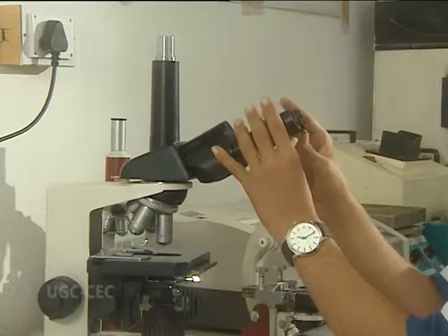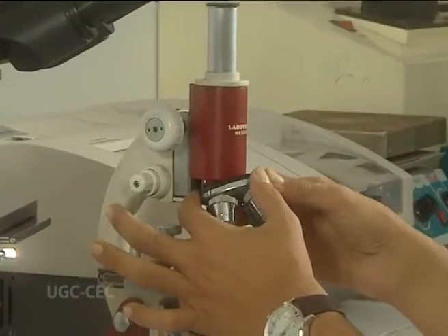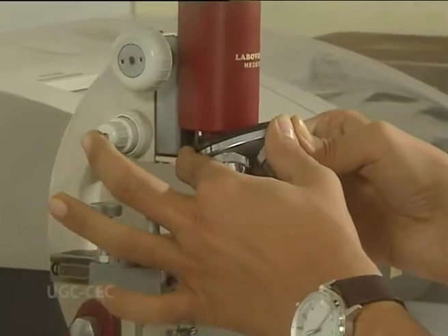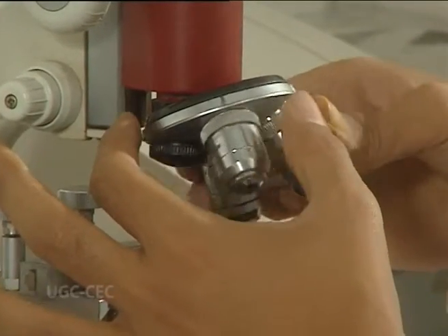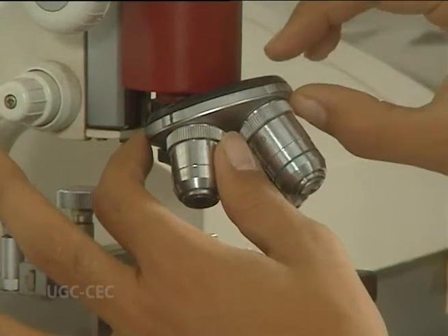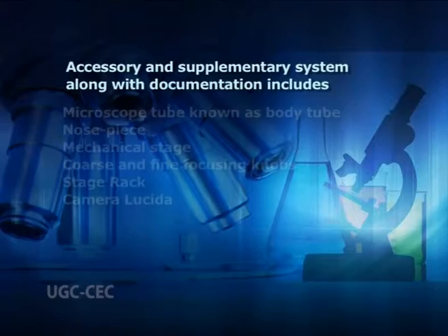Nose piece. The nose piece is attached under the arm of the microscope tube. The nose piece houses the objectives and rotates them. The objectives are arranged in sequential order of their magnifying power, from lower to higher. This helps to prevent the immersion oil from getting into the intermediate objectives.